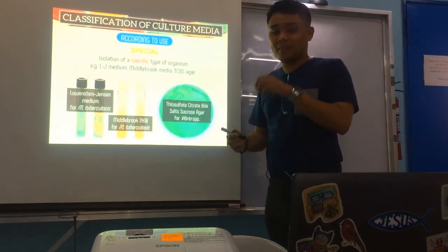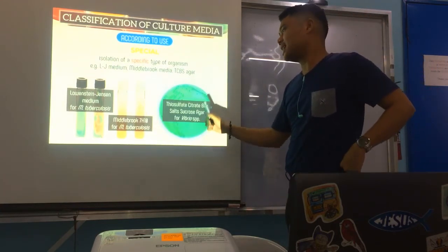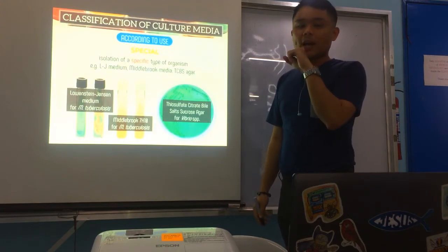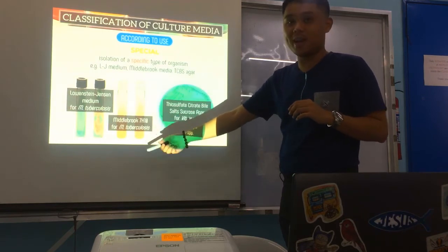And of course, you have your TCBS, thiosulfate citrate bile salt sucrose agar. That's for Vibrio species. Again, we'll have a different discussion for this in stool culture. And again, recall with MTB, usually we don't opt for culture for diagnosis.